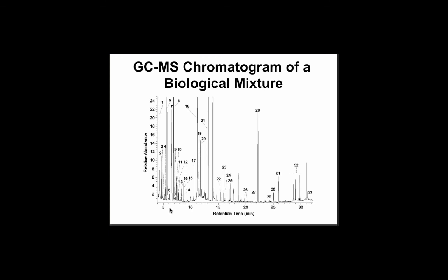Sorry. Yes? And here, in terms of how do you know that the first bit is 1 picogram? So what you typically do is you have a set of standards you've run through before, and they're often somewhat similar in chemical nature, or they're the exact compound. So you have a reference that you've run, and normally in GC studies, you'll run your reference early in the day, or you'll have a set of standards beginning, middle, end of day that help you calibrate those things. Some people also put in isotopic standards as well to help them get calibrations. But yeah, there's a pre-run standard, so you can always quantify.